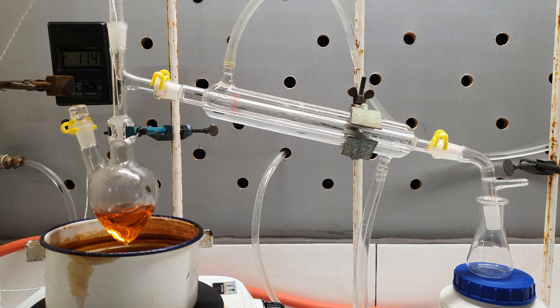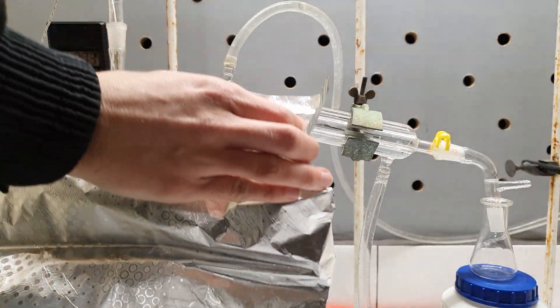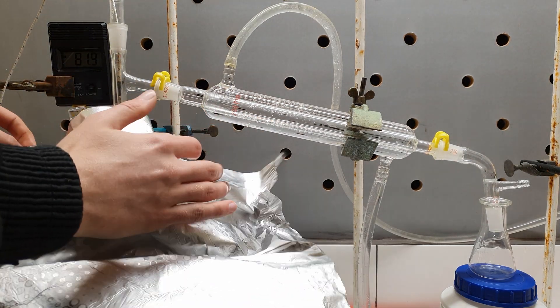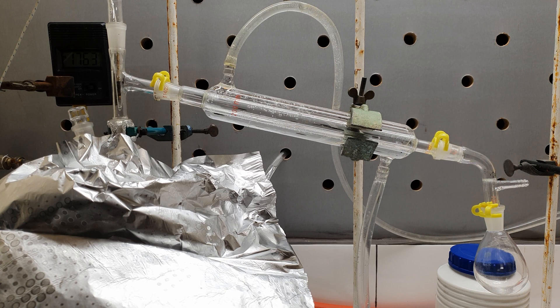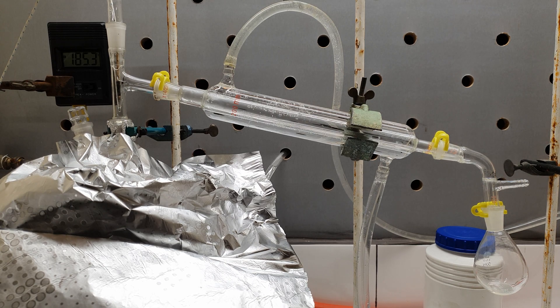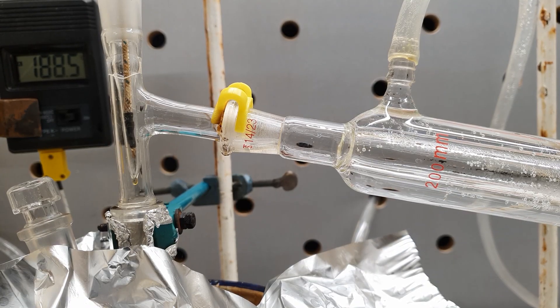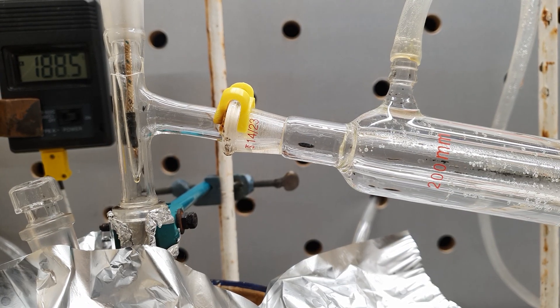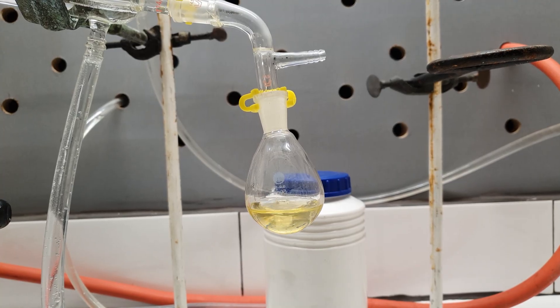A simple distillation was arranged and the flask was wrapped in aluminum foil to reduce heat loss. Soon a colorless liquid started to come over, which unfortunately soon became yellow — this is probably due to some iodobenzene decomposing from heat. Nevertheless, all of it came over between 190 and 195 degrees Celsius, so it should be sufficiently pure.